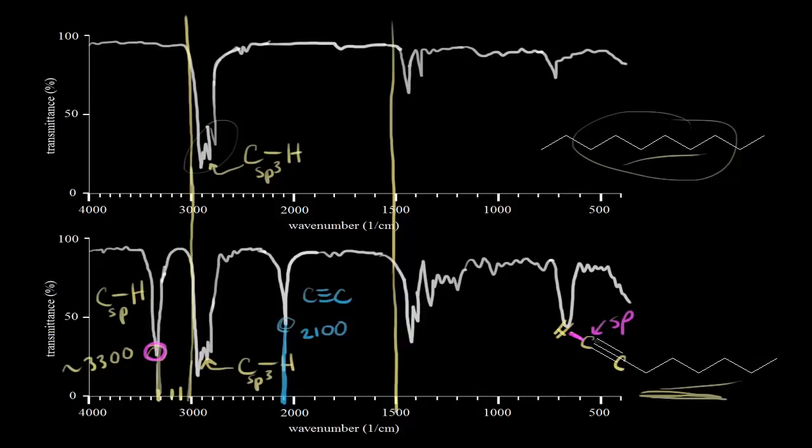And of course, obviously we have one. This is an alkyne here. And so hopefully this just shows you the differences. And once again, your fingerprint region over here is unique for each of these molecules. So this shows you the differences and helps you to think about how to analyze your IR spectrum. Let's look at 2 more.